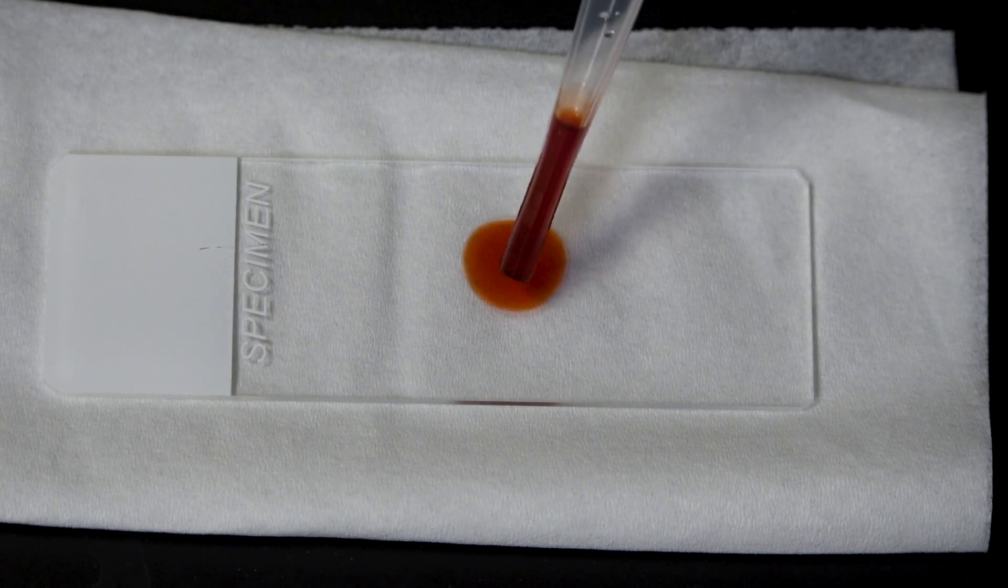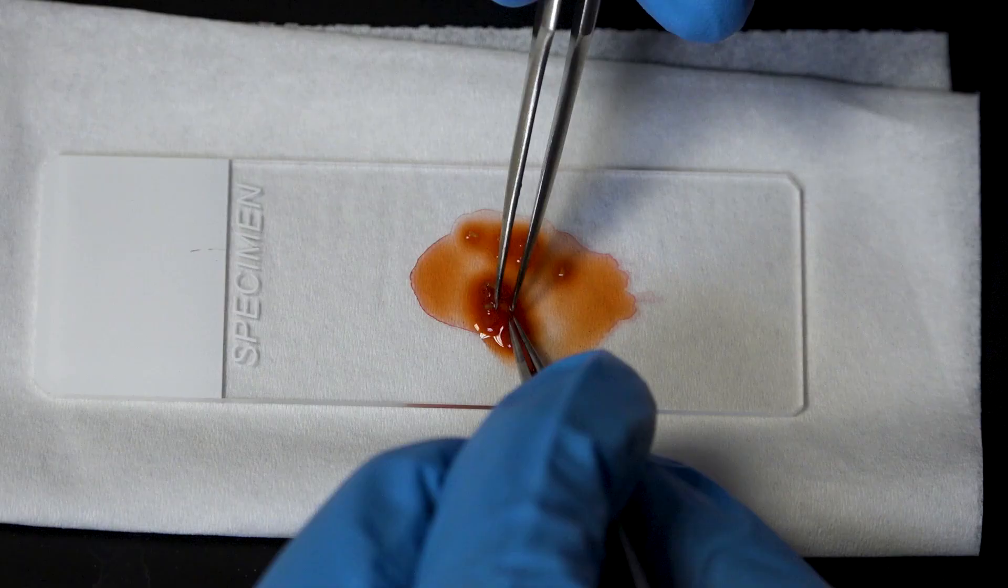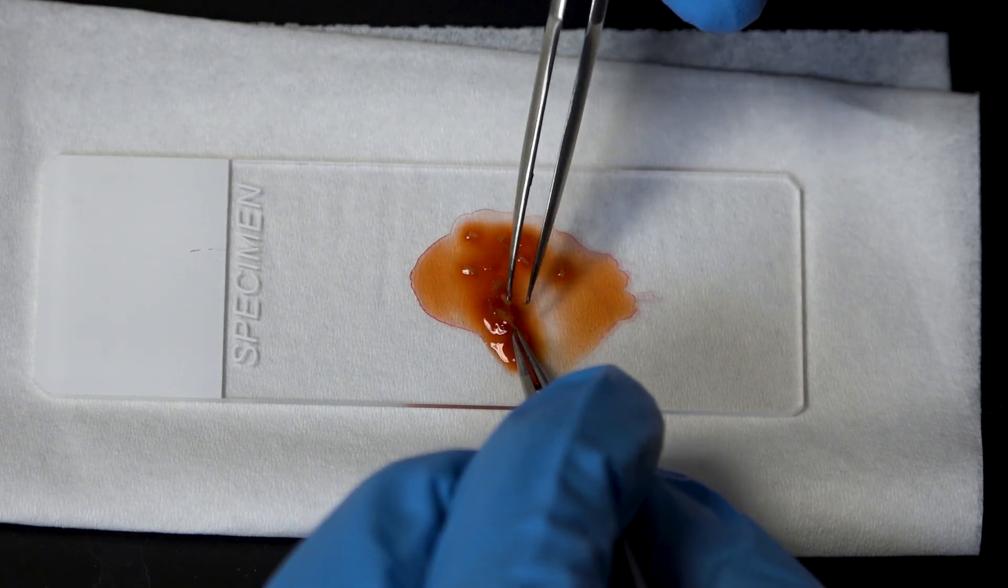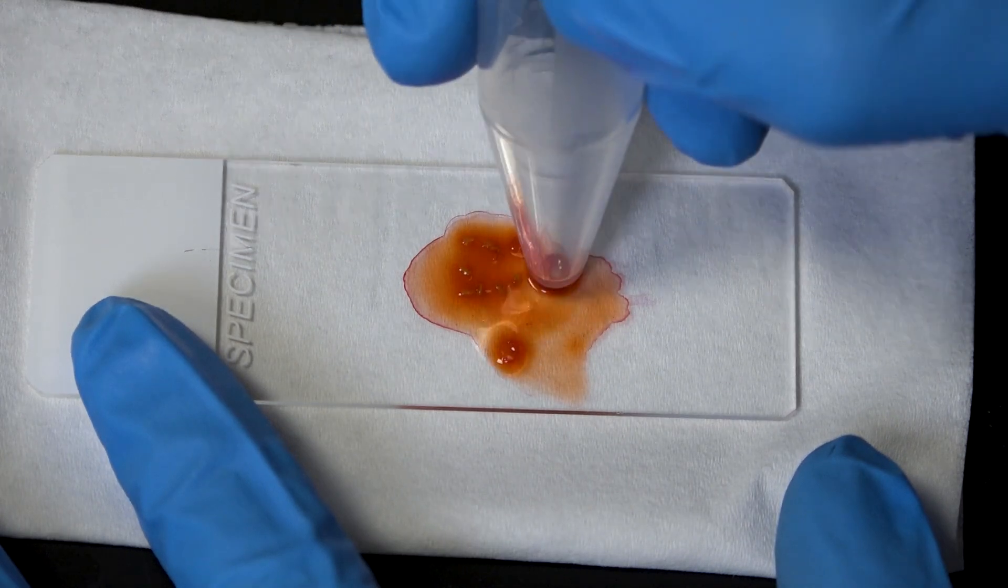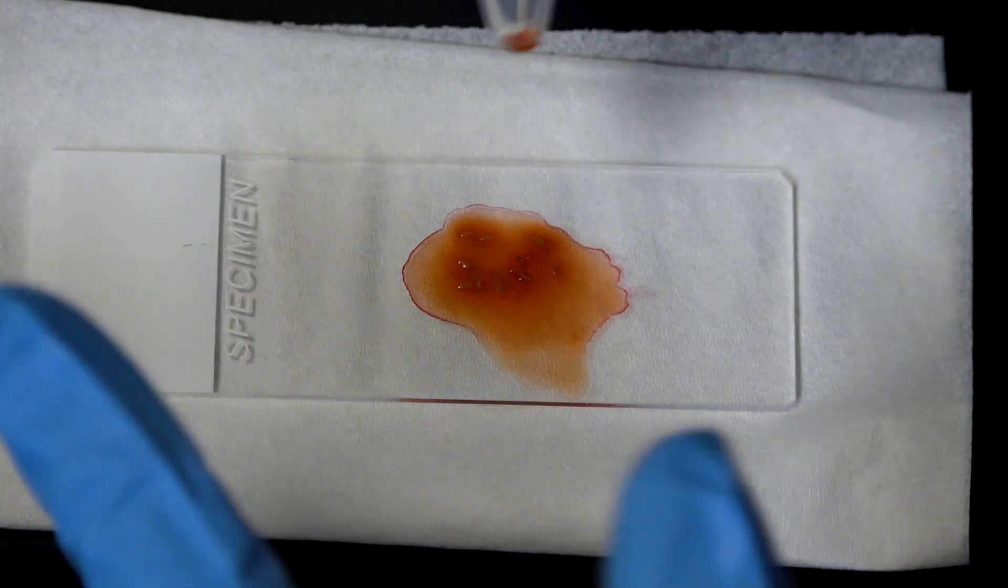So next I'm going to put a drop of acetocarmine stain on a slide, put a flower bud in that, and dissect out the anthers. The acetocarmine will stain the cell's chromatin red. Next I'll take the bottom of this test tube and gently squish the anthers a couple of times so the meiotic cells inside pop out onto the slide.